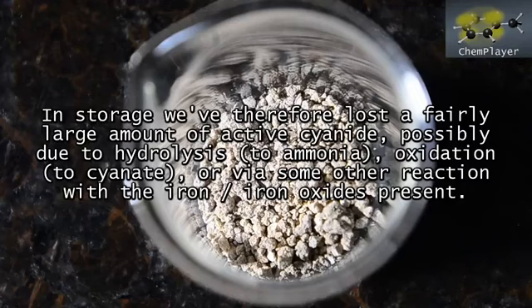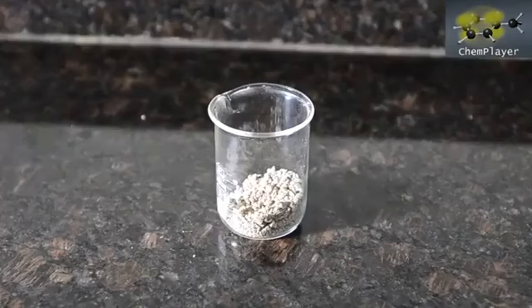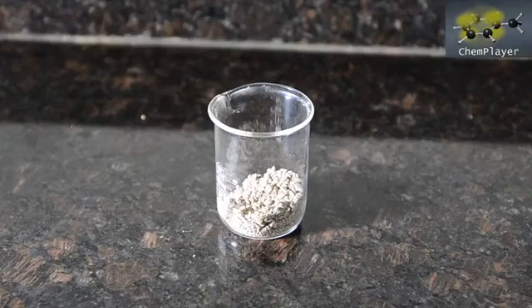We probably did also lose some in the initial filtering process as well though, so next time we'll have to try this again using freshly prepared melt, and maybe dissolve out the cyanide and extract more efficiently to see what the fresh yield is. That will have to be a job for our next series in the future.